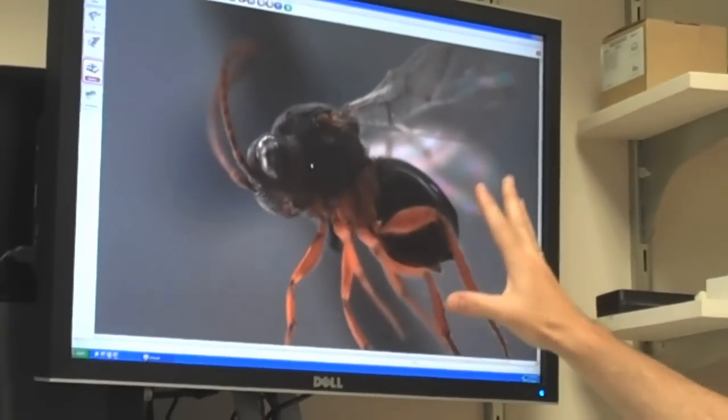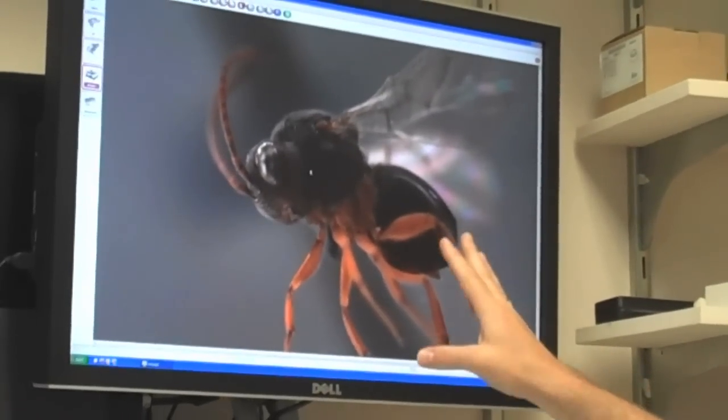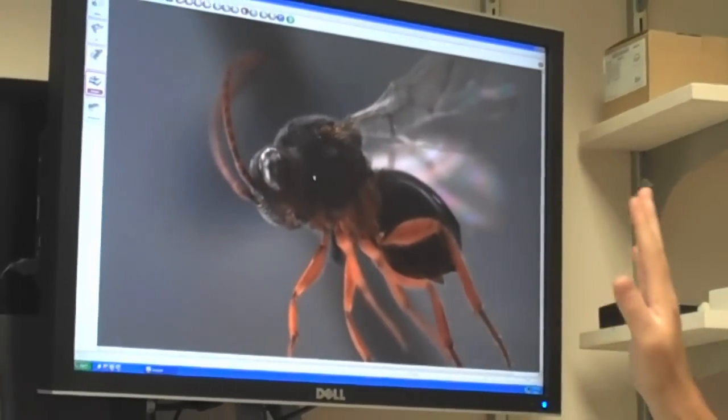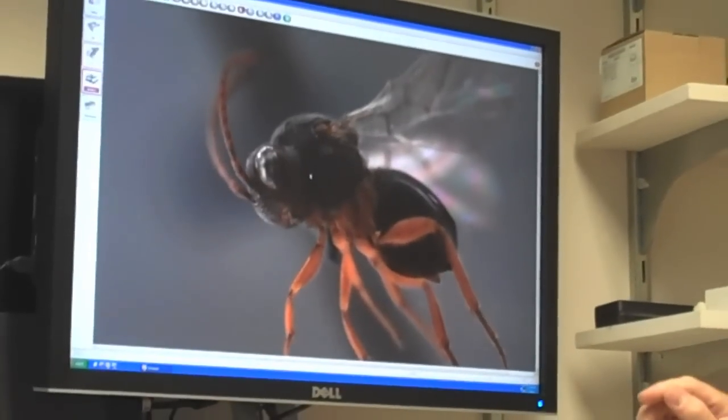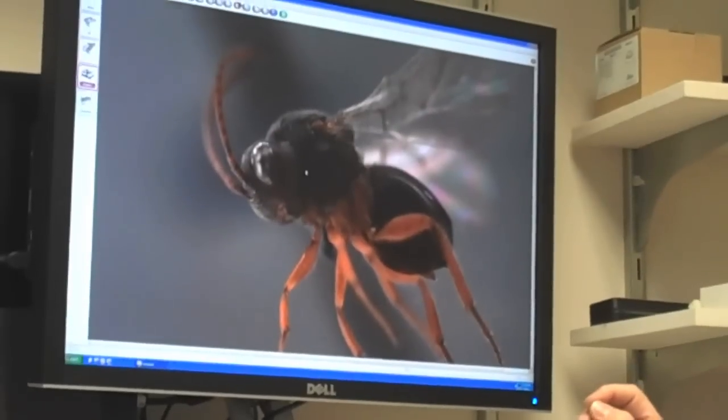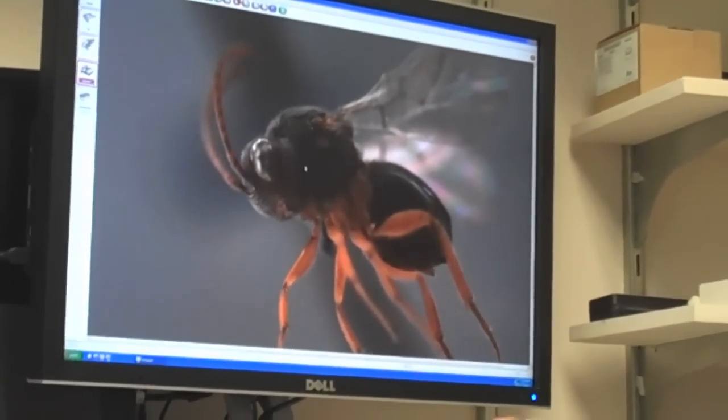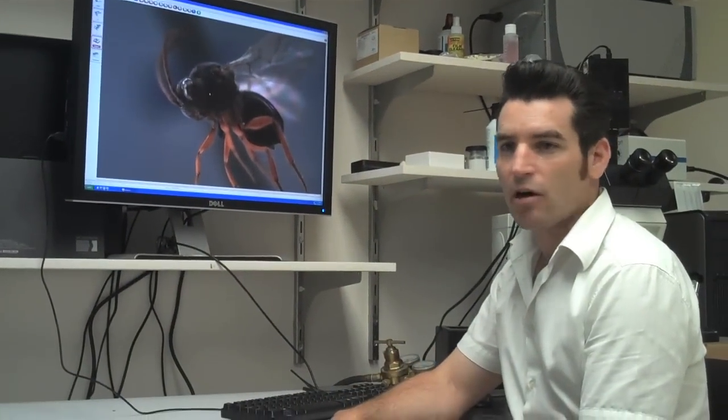The depth of field of these lenses is even shallower than the last system, so we still have to stack. And these images are much larger than the other system can produce. These images are about 15 megabytes each from this camera, and the microprocessor of the computer can only handle up to 42 images before it crashes. So we're pushing the limits of the computer itself.